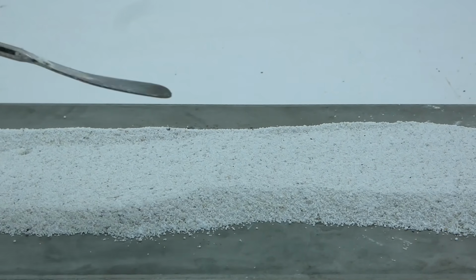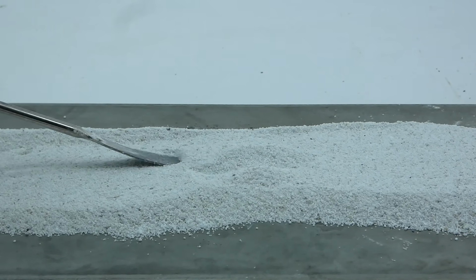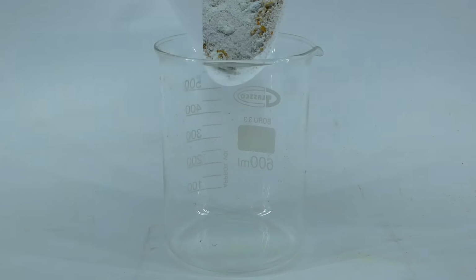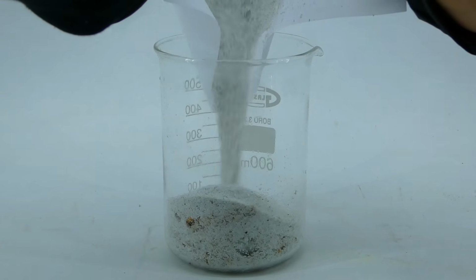The product looks similar to the starting sand, just a little whiter, and I honestly didn't know if the reaction even worked. To find out, I got all of the reaction mix into a beaker, followed by a generous amount of distilled water.